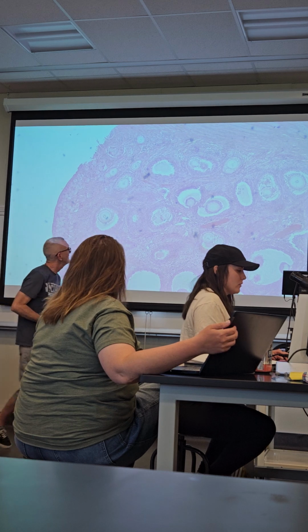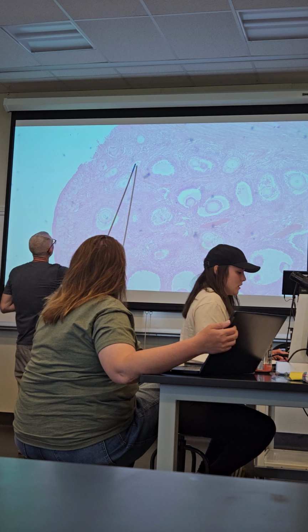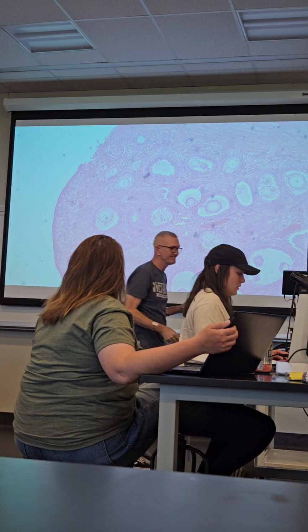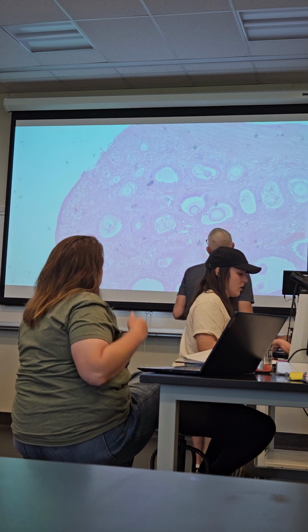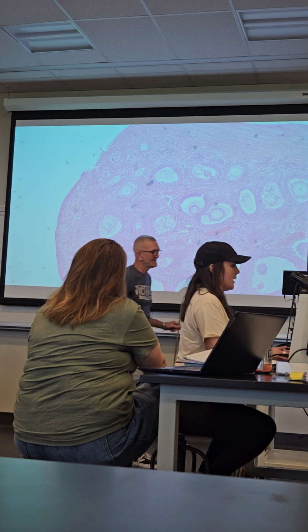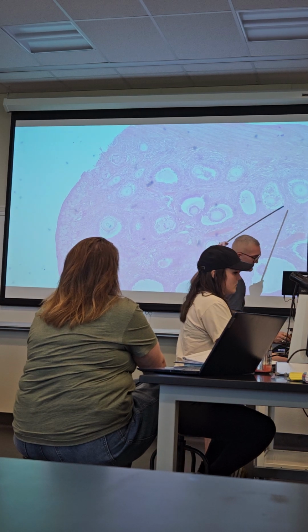What about just above it? Do you see that? Yeah. It's a secondary. I wouldn't use it because it looks like there's an antrum right there, but it's most likely a tear from when they made the slide. It's pretty darn small, and the reason I would call it primary too is because you only have one layer of granulosa cells. Okay. That's a secondary, that's a secondary, that's a secondary. Over here, we got another secondary.